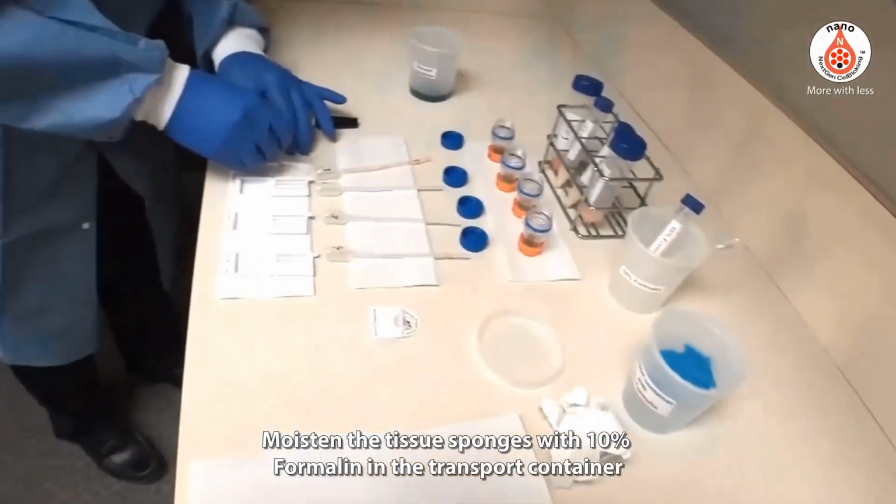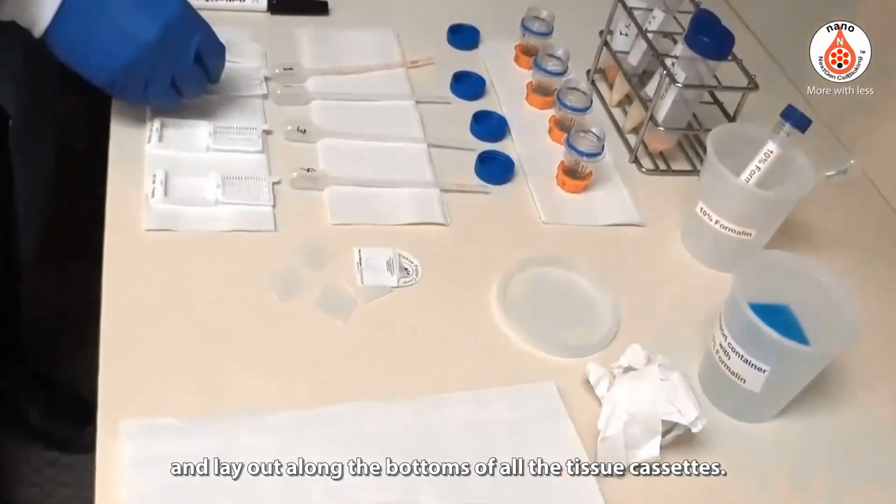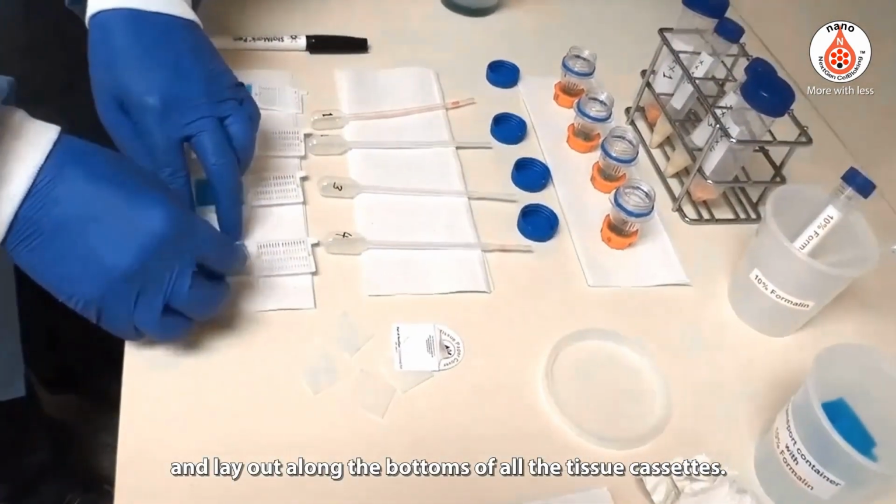Moisten the tissue sponges with 10% formalin from the transport container, and lay them out along the bottoms of all the tissue cassettes.